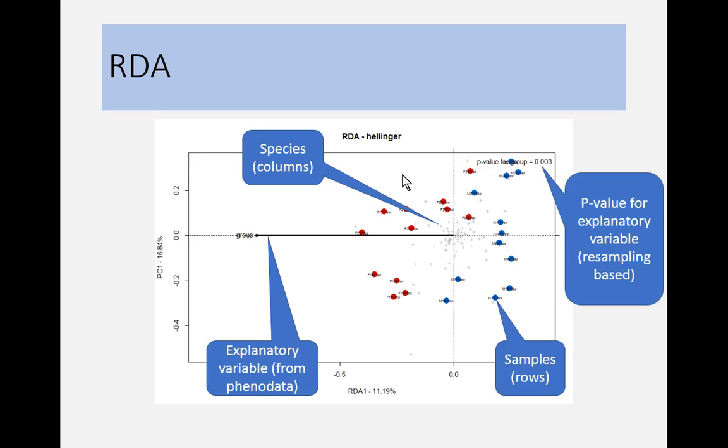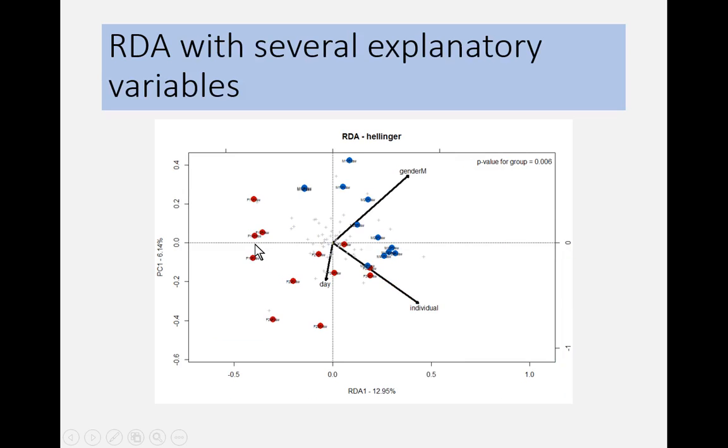So in Chipster you only have the possibility of testing one of those variables that you have measured from the individuals at a time, but it can be pretty easily done, for example, in R, and we can probably also program it into Chipster to support several explanatory variables in the same analysis. This is a pretty standard way to do the analysis nowadays.